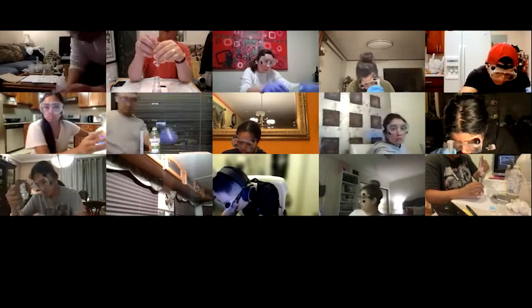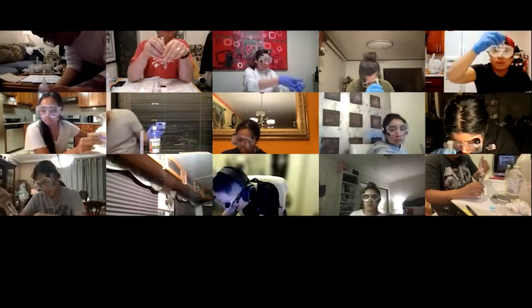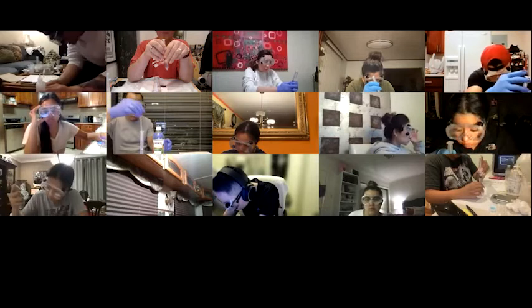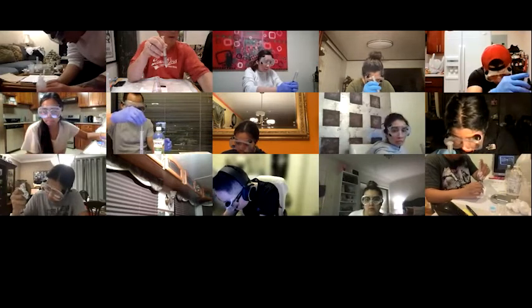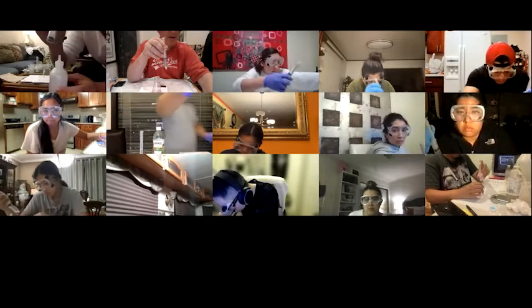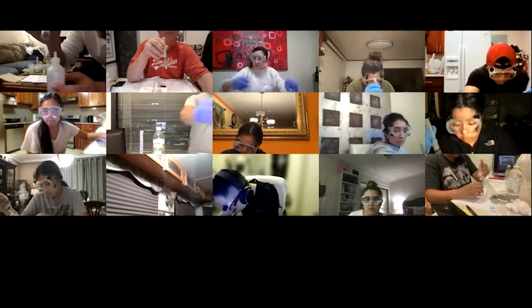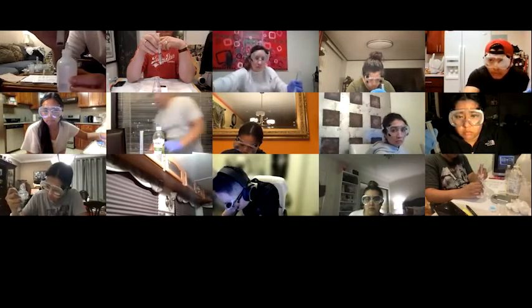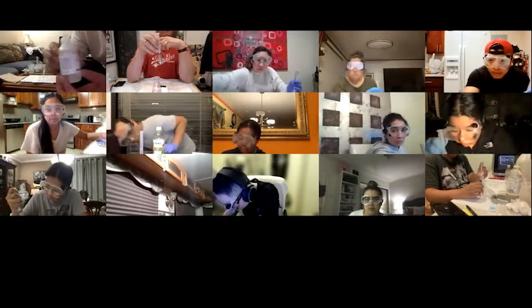Professor, I have a question for number 7 from activity 1. It says transfer approximately 10 milliliters of 1 M sodium hydroxide. 1 M, what does that mean? Molar. Is it this one? What does it say on it?